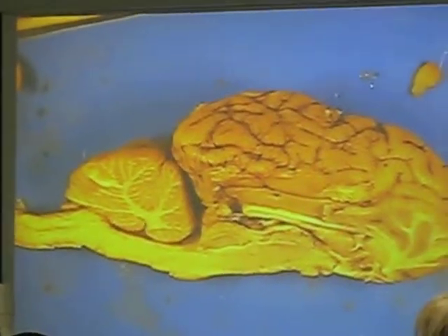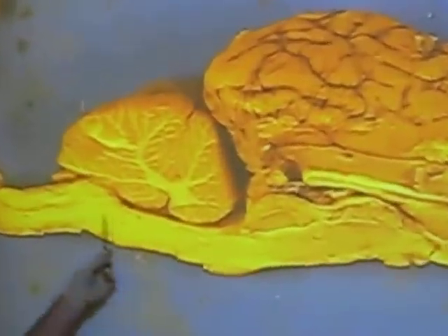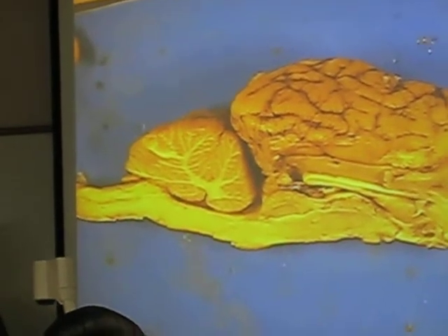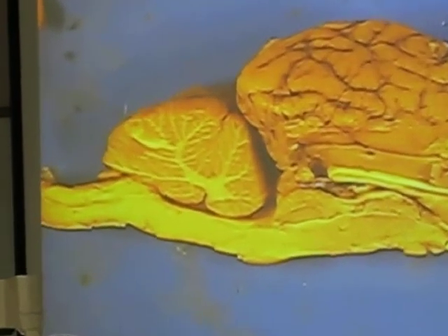Look at, how about along the brainstem? Well, underneath the cerebellum, this little swollen region here is all part of your pons. Right in behind the pons, you have a small segment of the medulla oblongata, and that leads into the spinal cord.